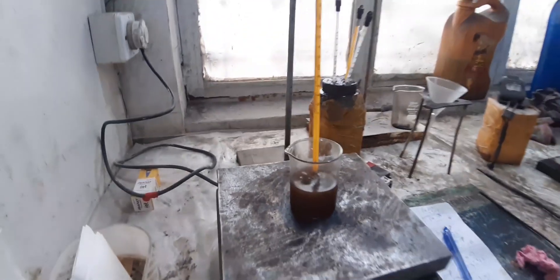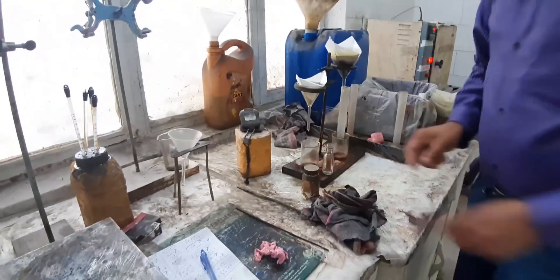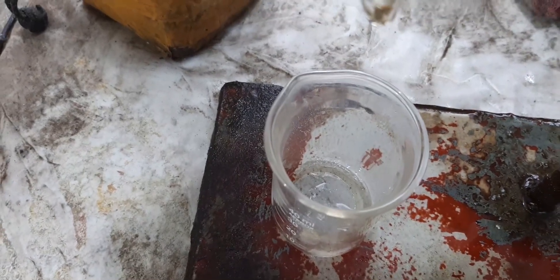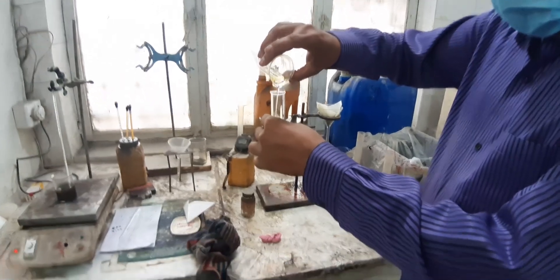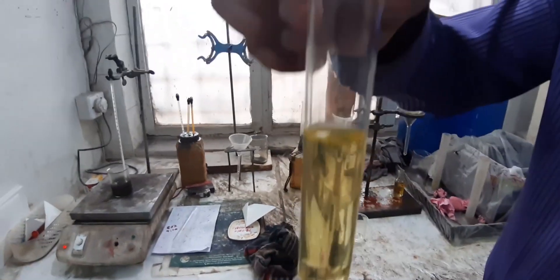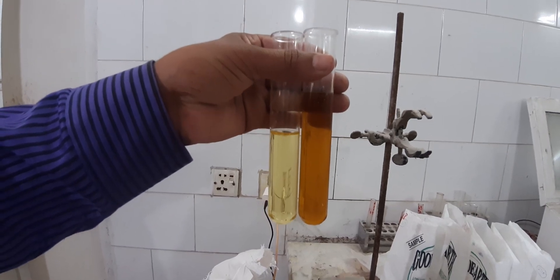After 20 minutes, filter the oil. Now we can clearly observe the difference between the raw oil and the bleached oil. The bleaching process has visibly altered the oil's appearance, making it lighter and more refined.